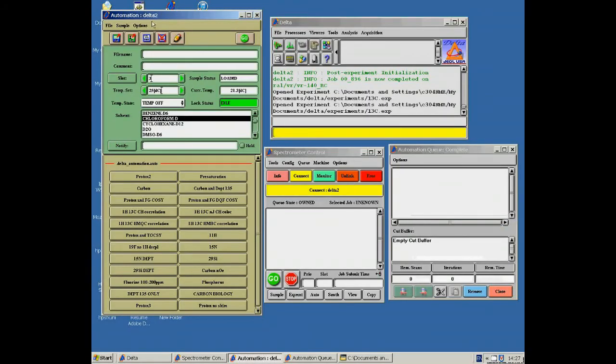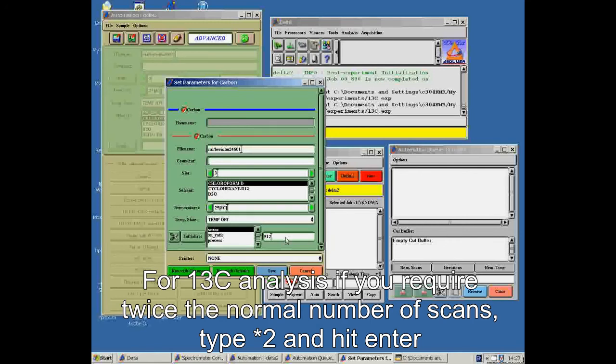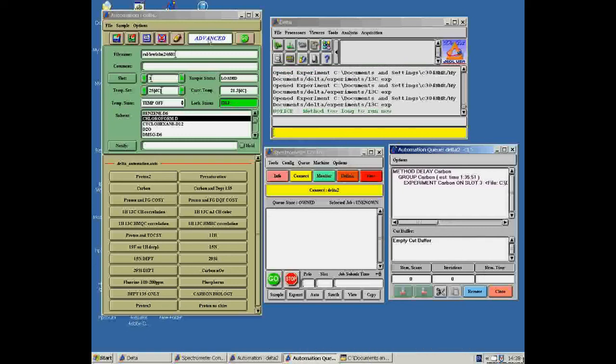If you are running an experiment which requires more detailed analysis, the advanced settings can be used. To open the advanced settings, simply click Options and then Advanced Mode. You can then alter the settings of an experiment. After choosing the type of analysis, the advanced box will appear. Here you can change the number of scans by multiplying the number in the box and hitting Enter. If this is the case, you should set the signal-to-noise ratio to 0. Once your scan is running, you can remove the advanced settings by clicking the button at the top.